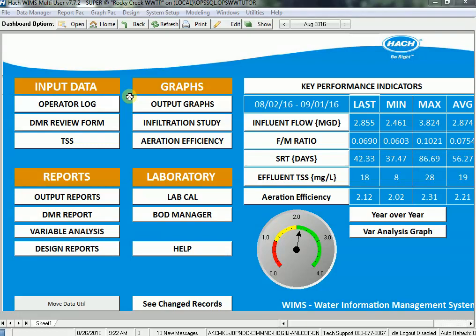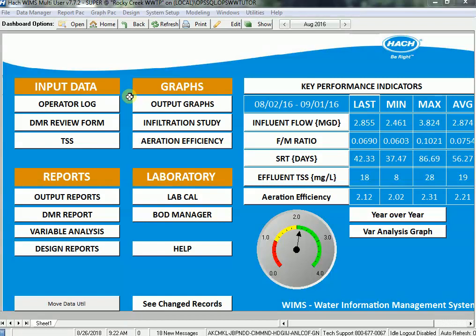Picture-type variables were introduced in version 772 of WIMS. They allow you, like you would track flow or track a value or number, to track a picture a day for a particular variable.